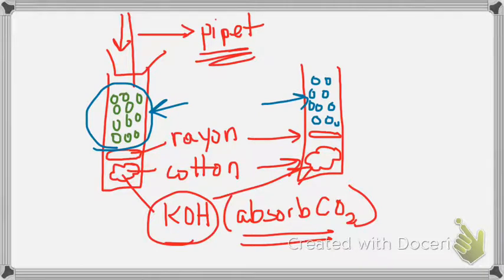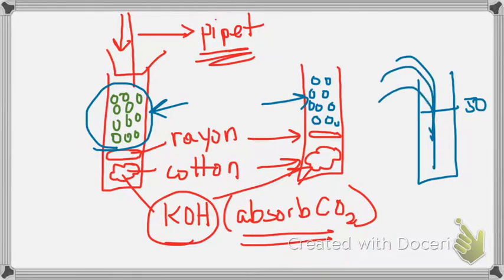In order to do that, I recommend using displacement. While you're getting this set up, you'd get a graduated cylinder. You would put in 50 milliliters of water. Then you plop in your peas. That volume goes up, and the difference is the volume of the peas. Then you would do the same thing for your beads. Start with the 50 milliliters and add beads until the volume goes up by an equal amount. So you've got an equal amount of space occupied.